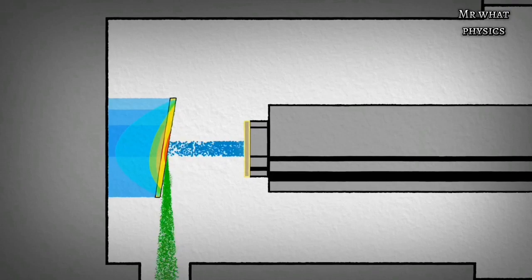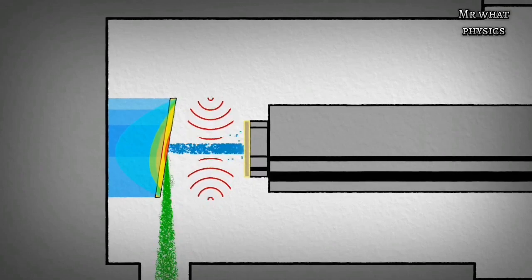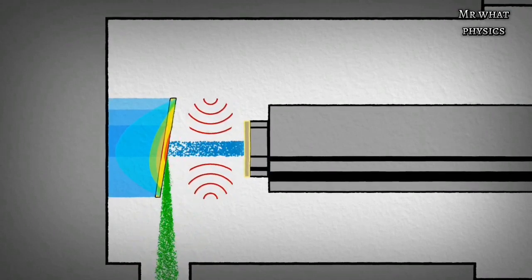Finally, the current state-of-the-art microfocus sources incorporate electron optics that condition the electron beam. Focusing and defocusing occurs instantaneously, enabling the fastest wavelength switches between 2 alternate sources.